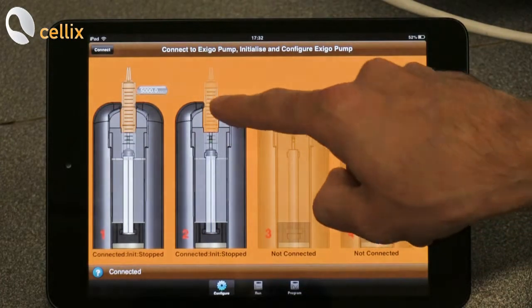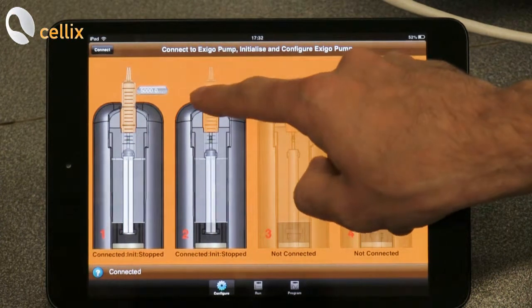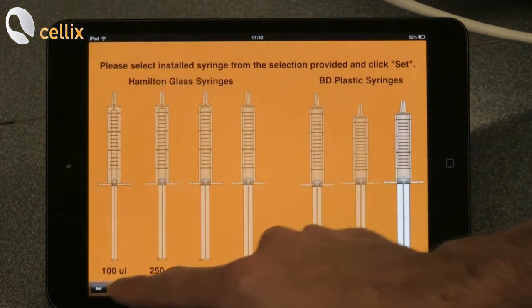We do the same operation for the second pump: we double click, we select the syringe, and then we click set.